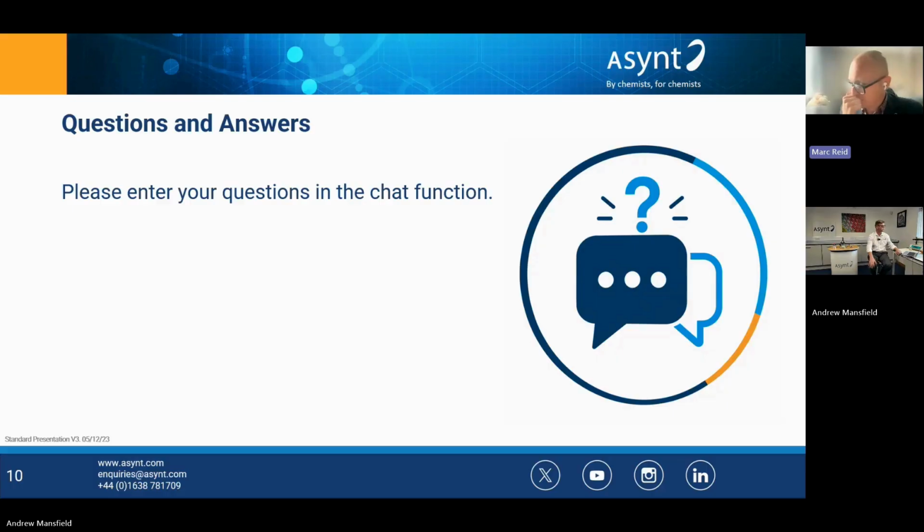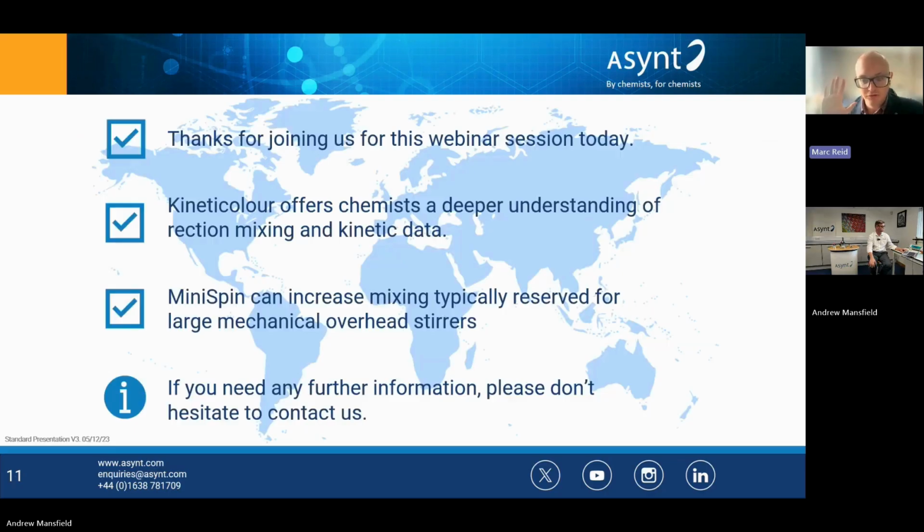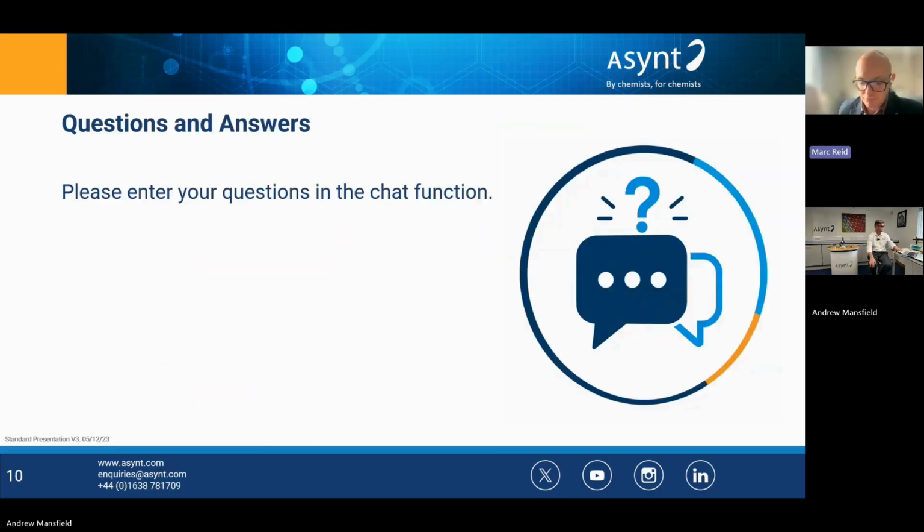So to give you another example, a lot of what I've shown today has been through using webcams or camcorders or phones to, in a zoomed out sense, look at a large reaction vessel, or look at the fullness of a vial. But we've also got projects going on where we've got more microscopic setups where we're looking in a very zoomed in sense at what's going on inside a petri dish. And that's in relation to some electrochemical projects that we're running at the moment.